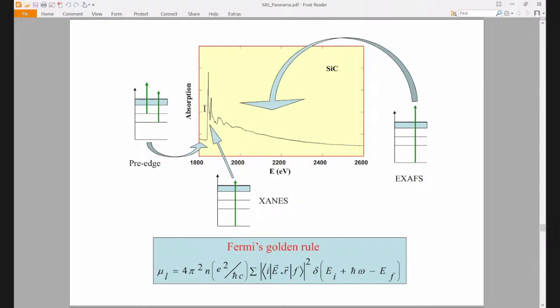The electrons which are doing only elastic motion in the medium are very few compared to the number of electrons which are at the end generated by the absorption process. But the other ones, we don't care because they're lost. They are not lost for the absorption, they are lost for the process we are studying. Okay? You will see why.